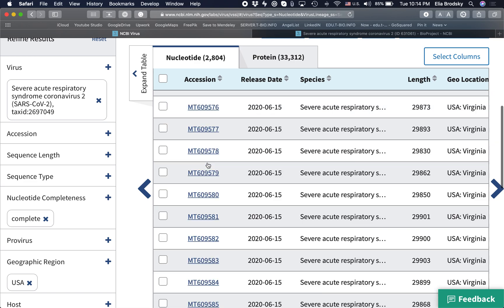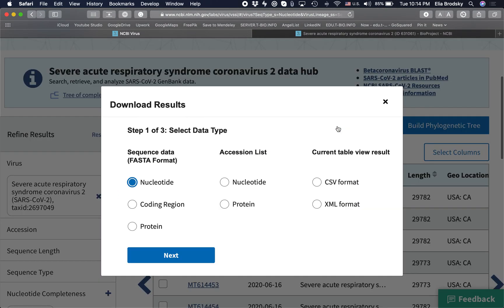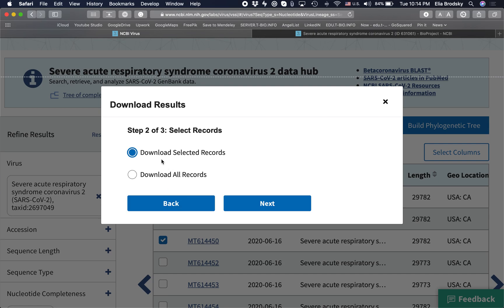Now that we've selected a number of these sequences, we can simply download them in FASTA format as genomic sequences. You can look at nucleotide, coding region, or protein options. You can also download the accession list, which will give you 12 accession IDs, or download all the data in CSV or XML format. Click 'Next' and then 'Download selected records.'